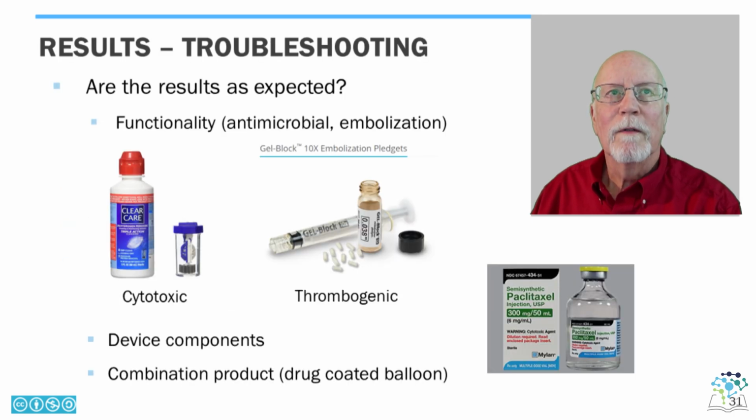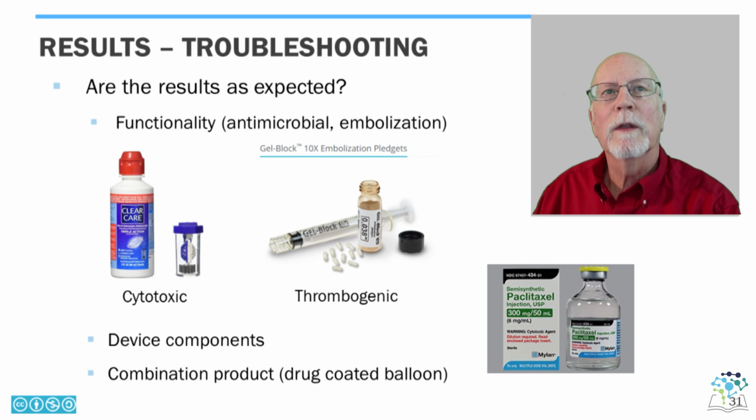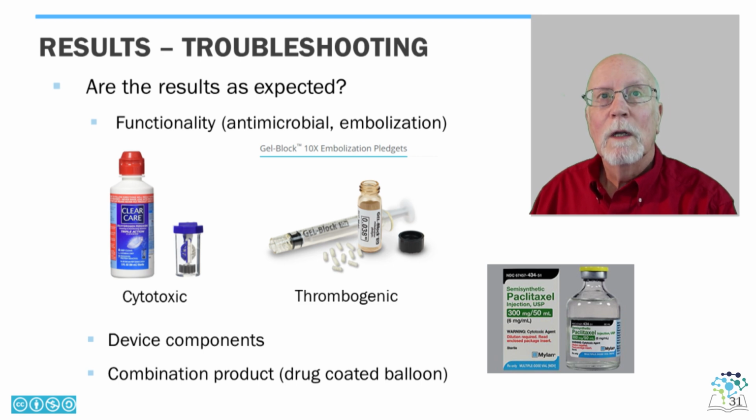Troubleshooting is the main job of our scientists in the Biocompatibility Lab. We try to identify hidden sources of test failure along with the clients. Some things should have been expected, but testing failures always require careful evaluation of what happened and why. Sometimes surprises occur, but we should have known.